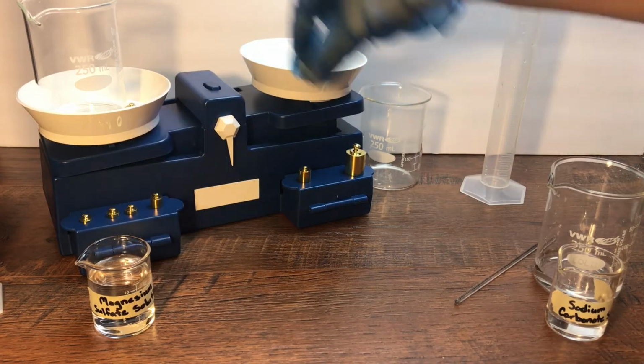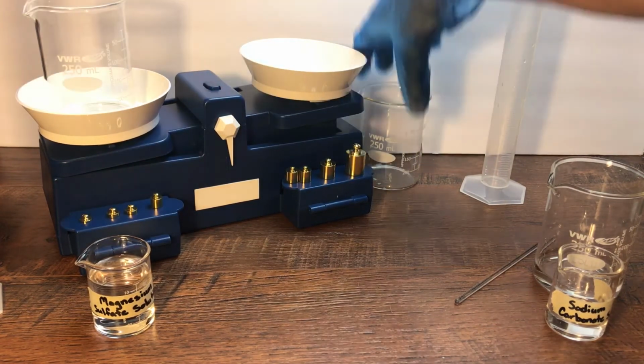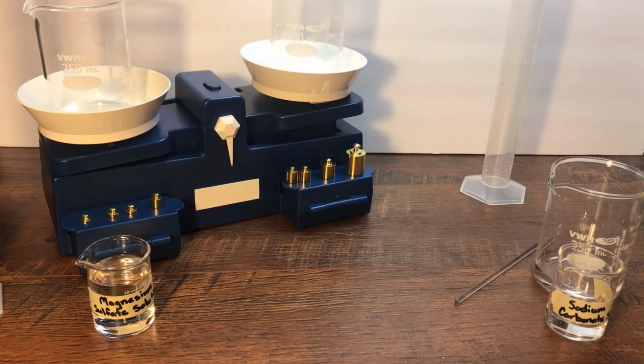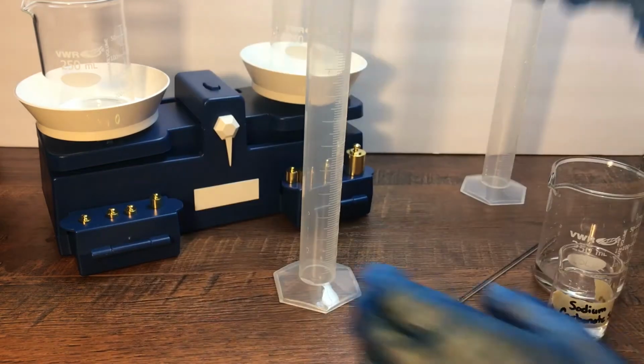Let's do that again with the magnesium. First, we're going to measure out 30 milliliters.